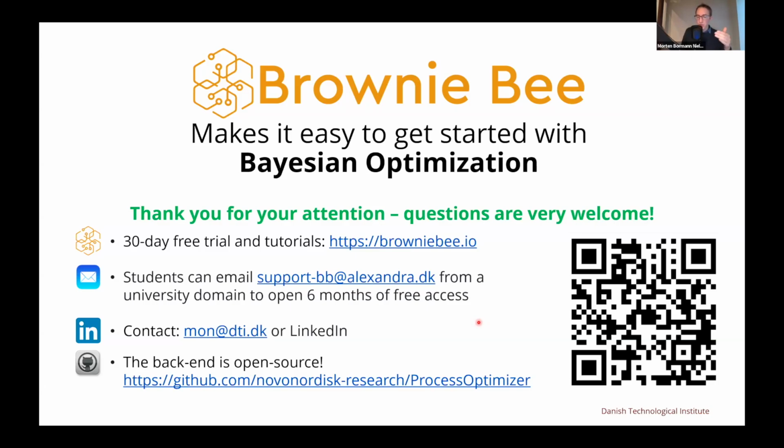Bayesian optimization also doesn't really help you if you have lots of categories. By categories, I mean things like red, green, blue, yellow, pink, where there's no order to these things that you can sort of establish. So let's say you have 50 different enzymes and you have no way of putting them into a factor. That is not something Bayesian optimization is good for.